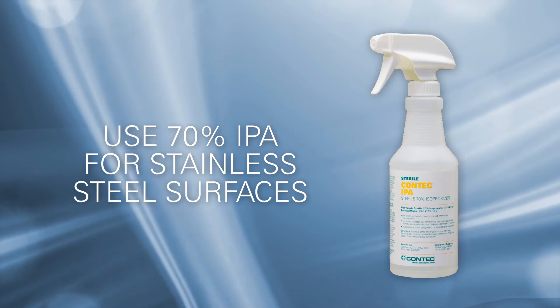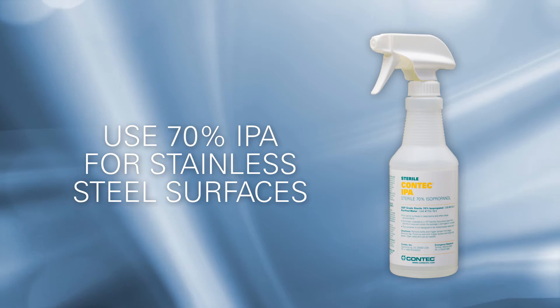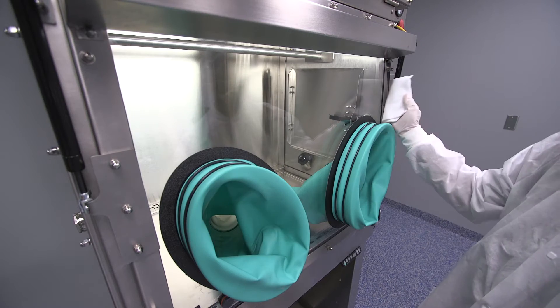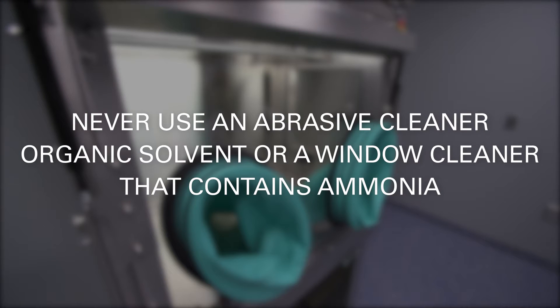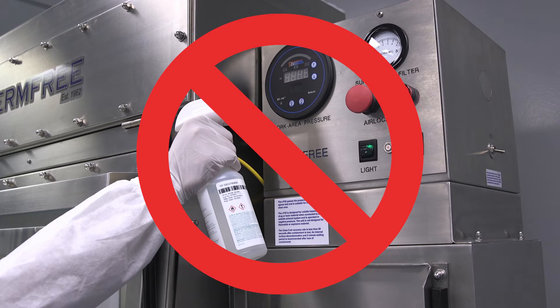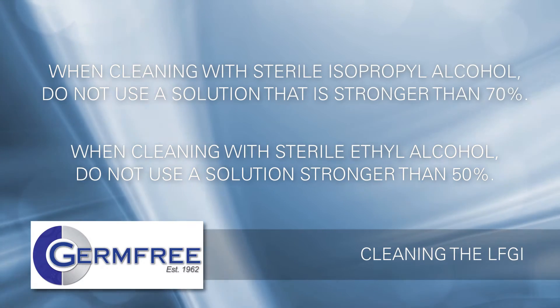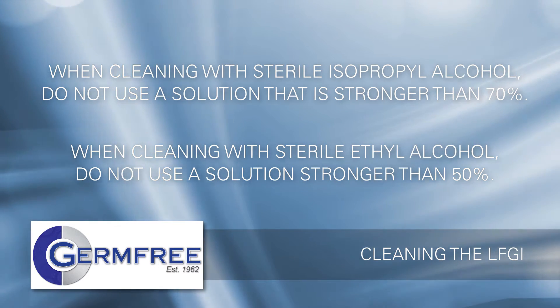Use the right solutions for each type of surface. On stainless steel surfaces, use sterile 70% isopropyl alcohol solution or a solution formulated for stainless steel. Acrylic front and side panels should be cleaned with a low linting or non-shedding wiper and a mild detergent or a solution specifically formulated for cleaning acrylic. To prevent fogging or crazing acrylic surfaces or the control panel, never use an abrasive cleaner, organic solvent, or a window cleaner that contains ammonia. Never spray a liquid cleaner or disinfectant directly onto an electronic instrument or control. When cleaning with sterile isopropyl alcohol, do not use a solution stronger than 70%. When cleaning with sterile ethyl alcohol, do not use a solution stronger than 50%.